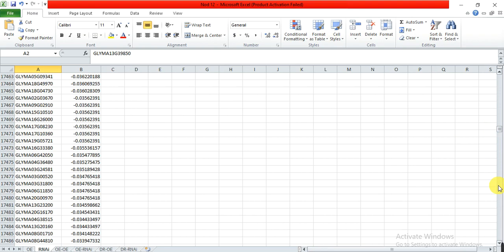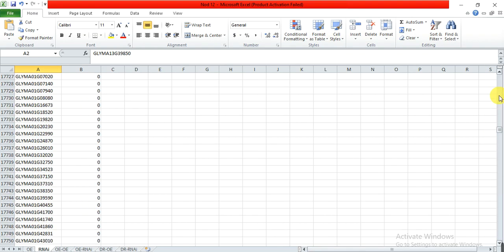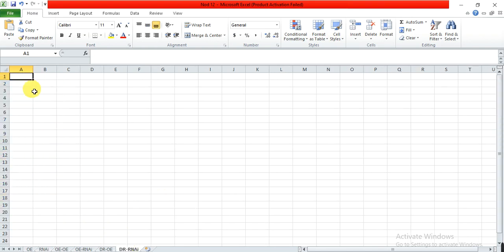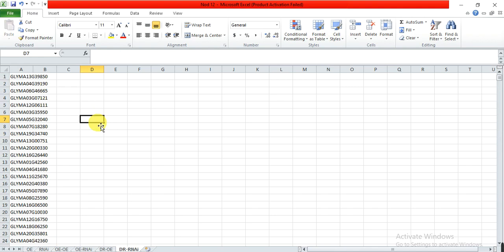We also select the downregulated genes in the RNAi lines and copy and paste them into a worksheet named 'downregulated genes in RNAi.' Now we have four categories: upregulated genes in overexpressed lines, upregulated genes in RNAi lines, downregulated genes in overexpressed lines, and downregulated genes in RNAi. Now let's show them in a Venn diagram.